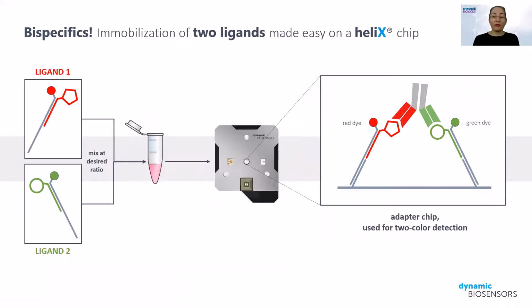To measure the cooperative binding to two antigens and the avidity effect on the dissociation, we have to immobilize both antigens at the same time on our surface. The DNA-based switchSENSE chip allows full flexibility and control concerning the immobilization of antigens. If you are working with two different antigens, you can color code them by hybridizing one of them to red labeled DNA and the other one to a green labeled DNA.